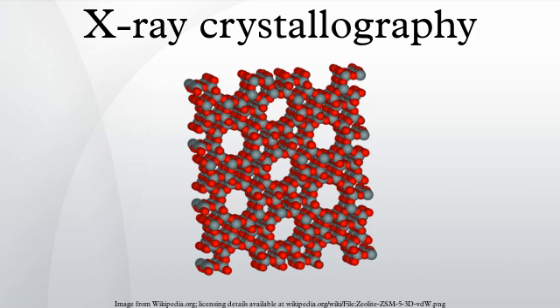Having assigned symmetry, the data is then integrated. This converts the hundreds of images containing the thousands of reflections into a single file, consisting of records of the Miller index of each reflection, and an intensity for each reflection. A full dataset may consist of hundreds of separate images taken at different orientations of the crystal. The first step is to merge and scale these various images, that is, to identify which peaks appear in two or more images and to scale the relative images so that they have a consistent intensity scale.